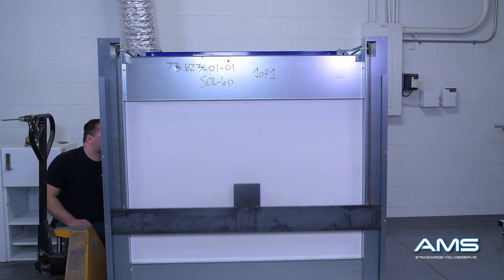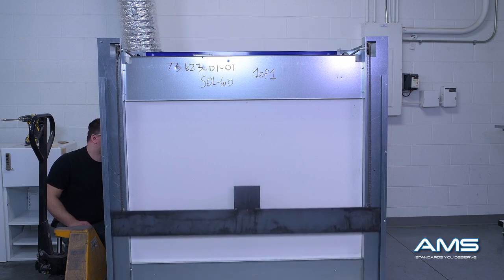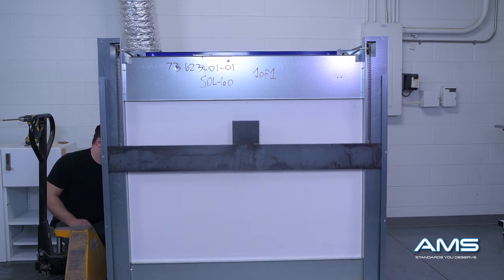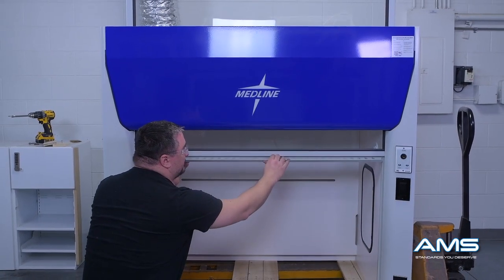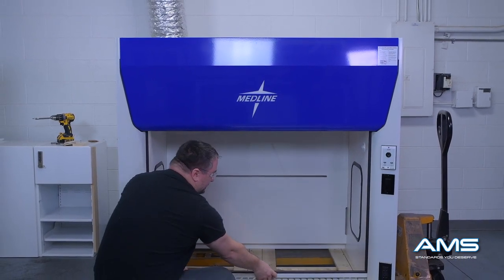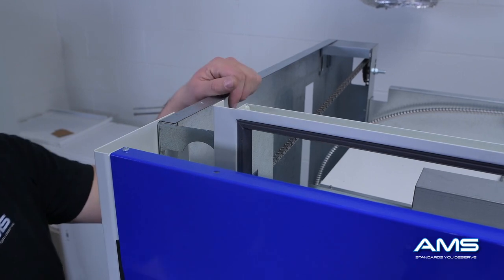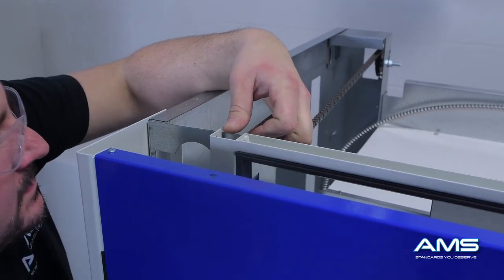While the fume hood is still on the crate on the floor, run the sash up and down several times. The sash should move up and down effortlessly and should be level from side to side — not going up at any sort of an angle. All sashes are inspected and leveled before they leave the factory, but it is still important to inspect the sash after shipping to make sure that nothing has shifted.